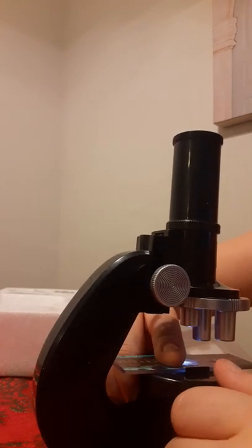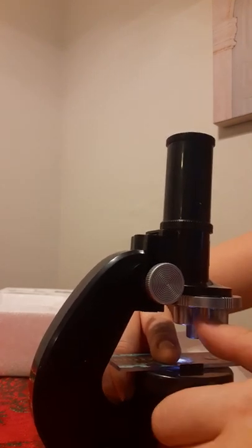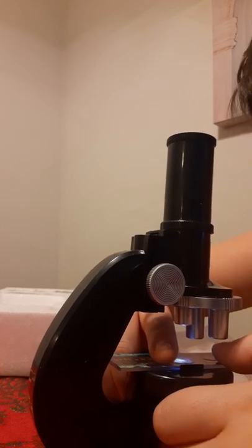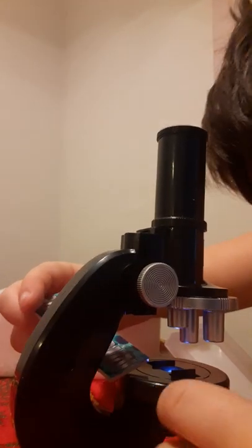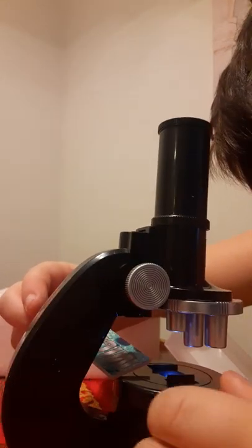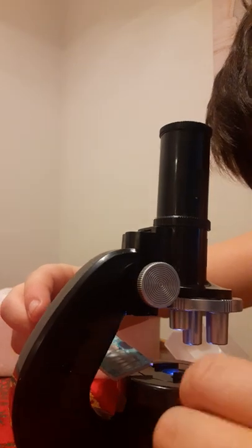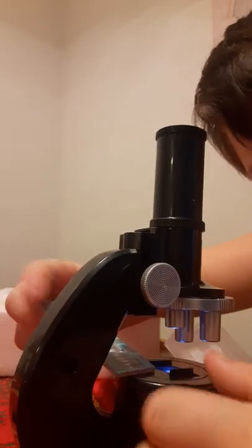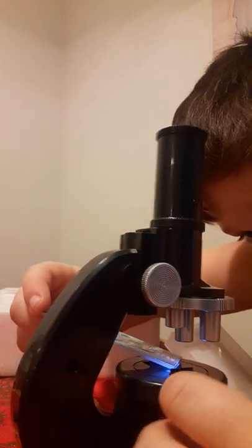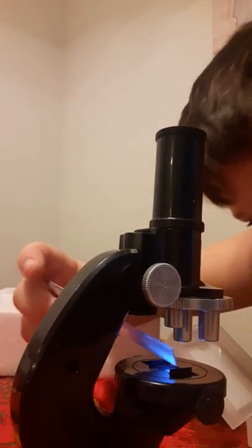Why does this thing keep popping out? Like it keeps popping out. Basically it doesn't have a grip. Maybe it's because... sorry if it's taking so long guys.